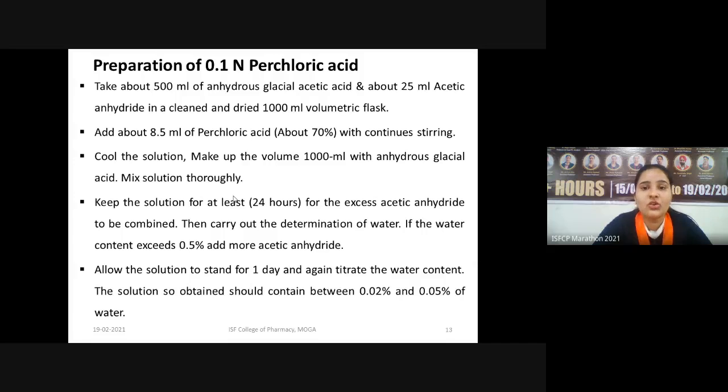Continuous stirring is done to prepare a homogeneous mixture for titration. Always we should be sure that the solution which we are using should be homogeneous. If our solution is heterogeneous, it will settle at the bottom, and hence our solution will not have uniform concentration throughout the flask. The upper layer might have lower concentration and the lower layer might have higher concentration. So the stirring should be done at a proper interval so that the solution prepared has completely uniform concentration.